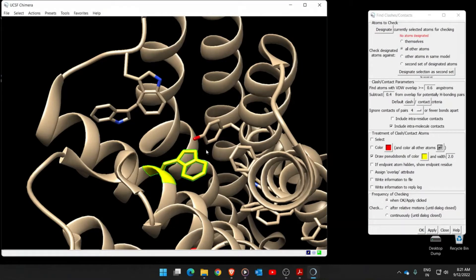The first thing to do here is to designate the selected amino acid - it is shown in yellow on the left-hand side. Click on Designate. It now says 14 atoms designated. These 14 atoms belong to the amino acid we replaced, which is tryptophan.